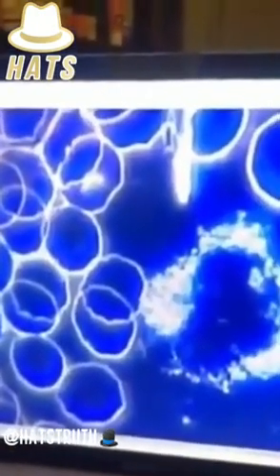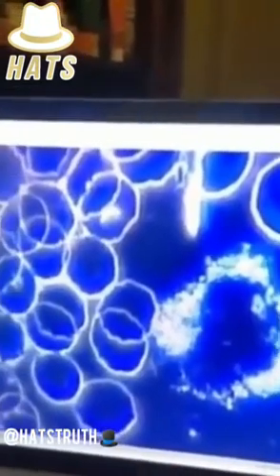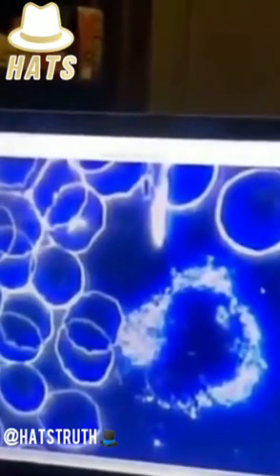Okay. And this here is what, Dr. Peggy? A white blood cell, but it's destroyed. This is a white blood cell that has been totally destroyed in a vaxxed person. Okay, what are we looking at here? This is very bizarre. I have no answer. I sent this photo to doctor friends and asked if they see similar things, and they say yes. And I really don't know what this is.